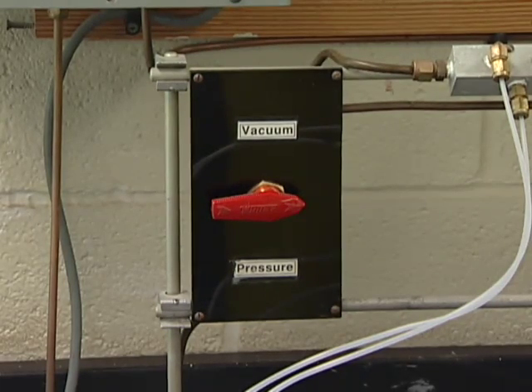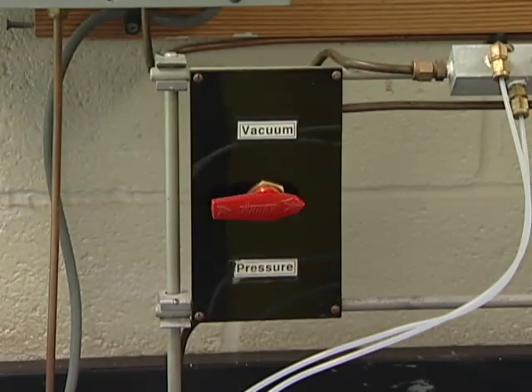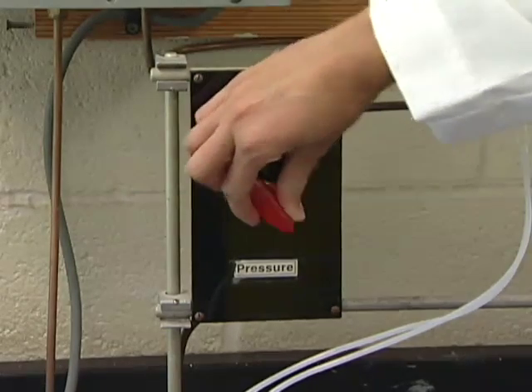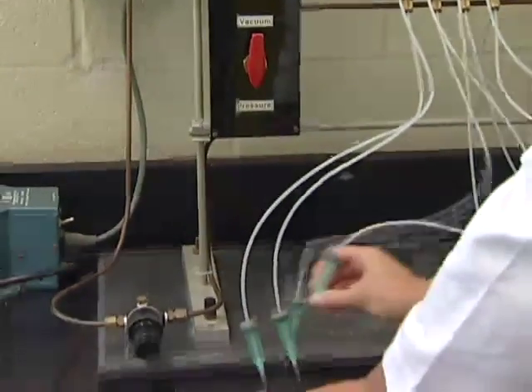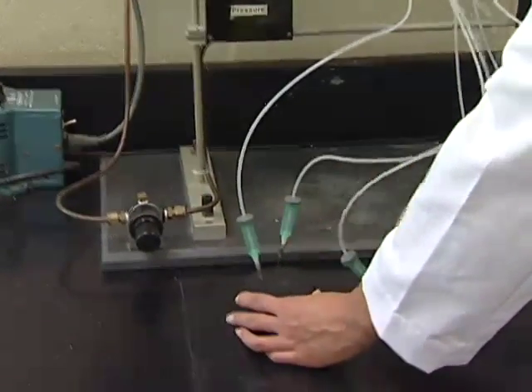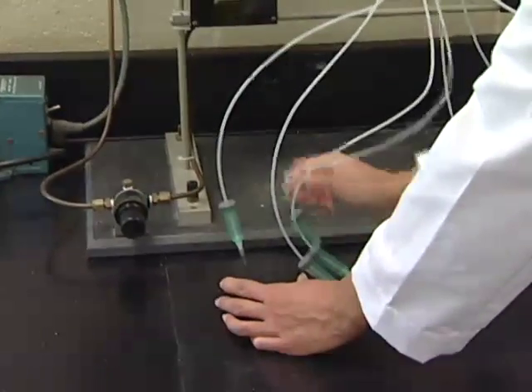To start up the pressurizing gassing station, turn the three-way valve to pressure and remove the gassing line needles from the large rubber stoppers. This is done to flush out the gassing lines.